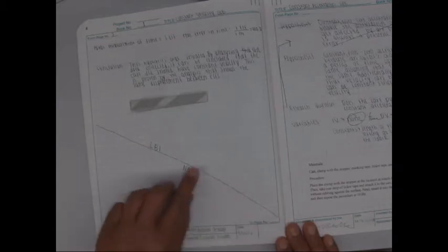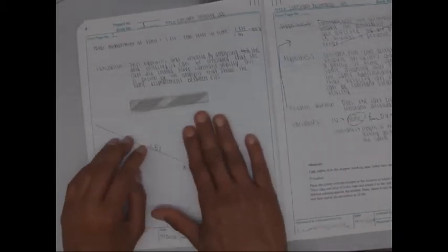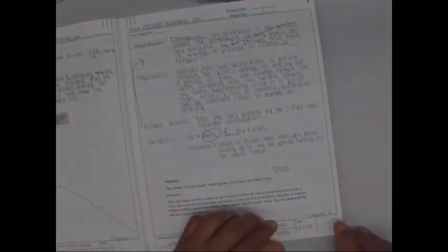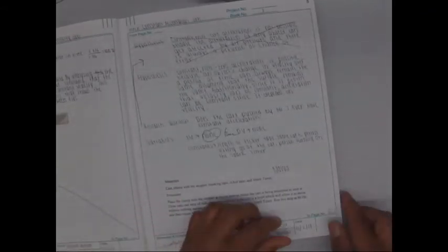Another important thing you should notice, the student has struck this off and says LBI. What is LBI? LBI means left blank intentionally. That means I am not putting an empty page here to fill up later. I am intentionally leaving this blank because I want to write on the next page. You can also see that the student has written page number 6 here, from page number 5. Sometimes you can jump a few pages because something else was done in between.